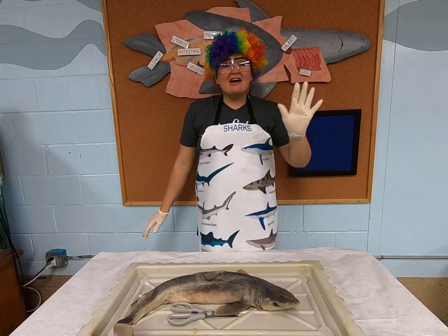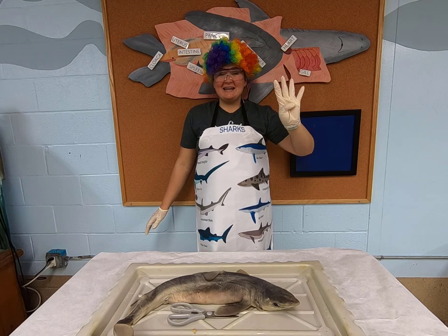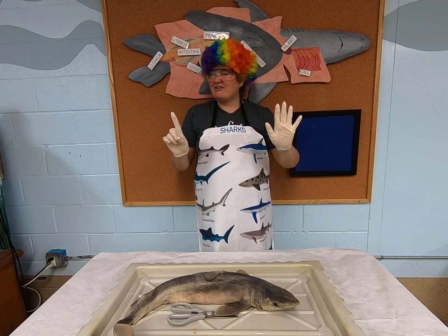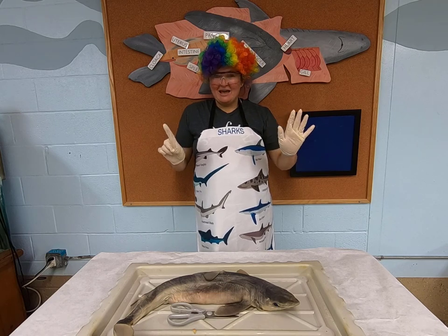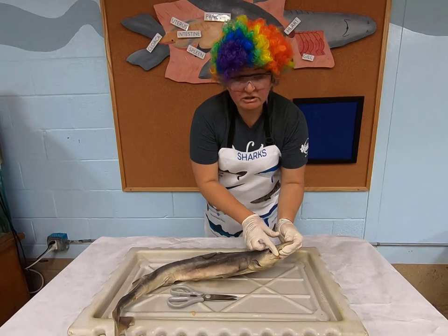So we have five senses. We have sight, smell, hearing, taste, and touch. But sharks have a sixth sense as well. They have a little mystery sense to them. Now, sharks do have eyes. We'll dissect the eye later, but the eyes are really cool for the shark.